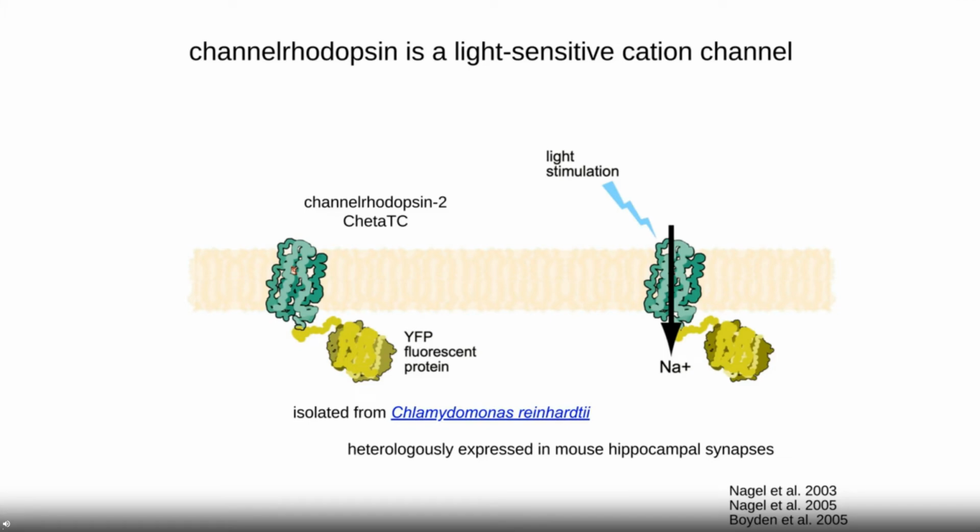And so the way that Shigeki and others developed this, starting over 10 years ago, is initially using a system that they named flash and freeze. The freeze obviously comes from high pressure freezing. The flash comes from the fact that you're using light to stimulate the cells. In this system, they use a molecule that will be familiar to any of the neuroscientists here, channelrhodopsin.